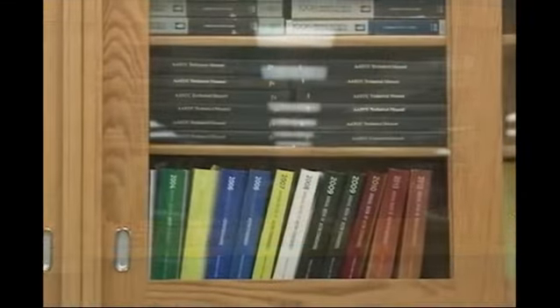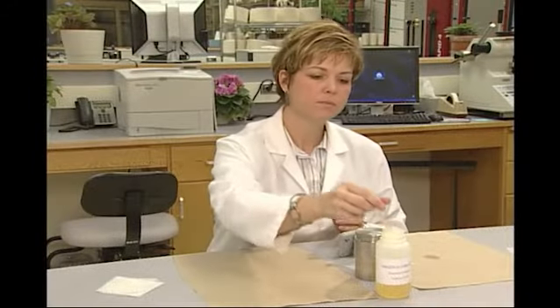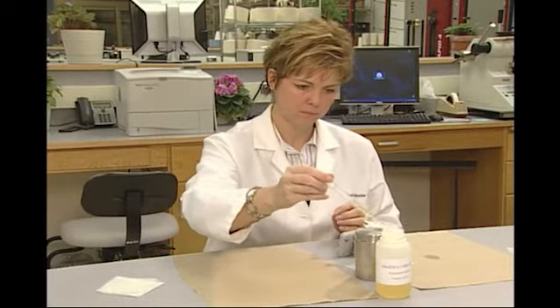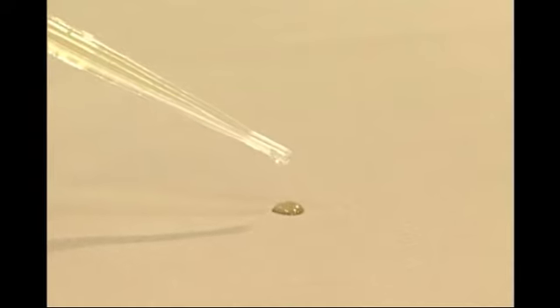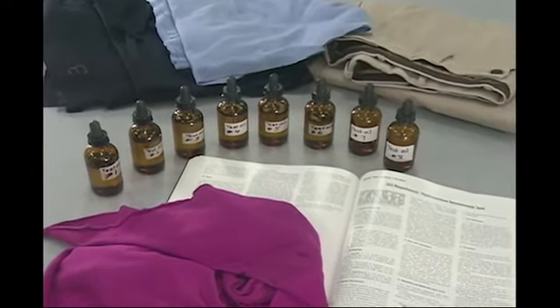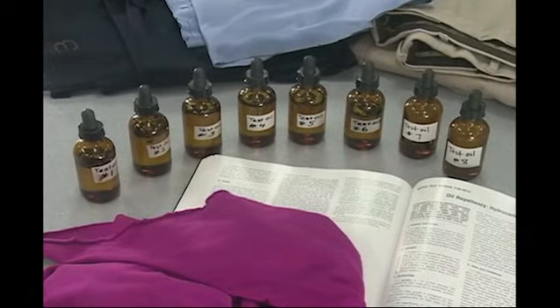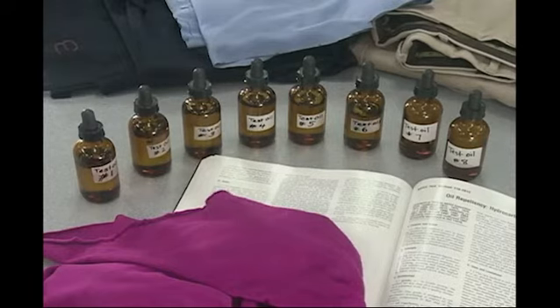AATCC Test Method 130, Soil Release: Oily Stain Release Method, is the standard developed by textile experts in the late 1960s to evaluate whether soils will come out of fabrics after laundering. Test Method 130 has several important elements that lend themselves to a performance-based standard method, but they also present challenges to standardization. What should be the standard oily soil medium to use in a test for judging oily stain release? What laundering conditions should be used to judge soil release? How are different levels of oily stain release to be judged?